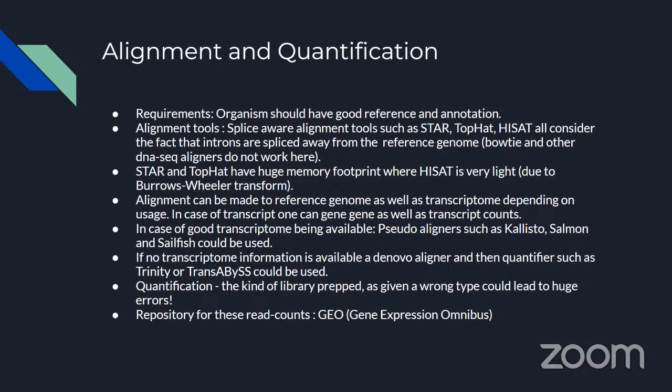It's a very good group, and most of the papers use STAR or Trinity and so on. That is my opinion over here.